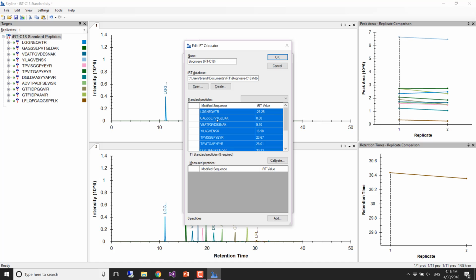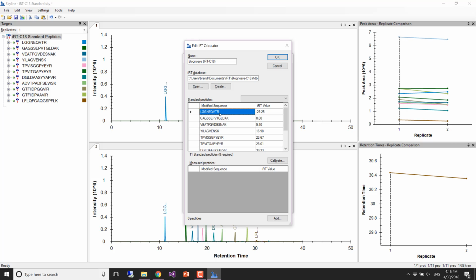If your numbers were off, well, you have some options.